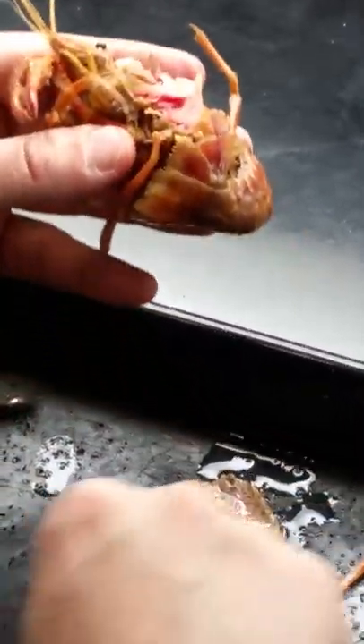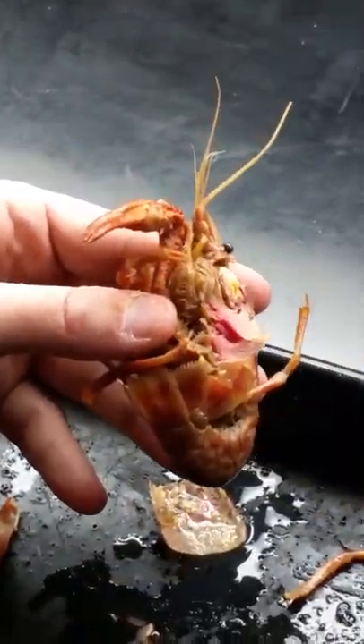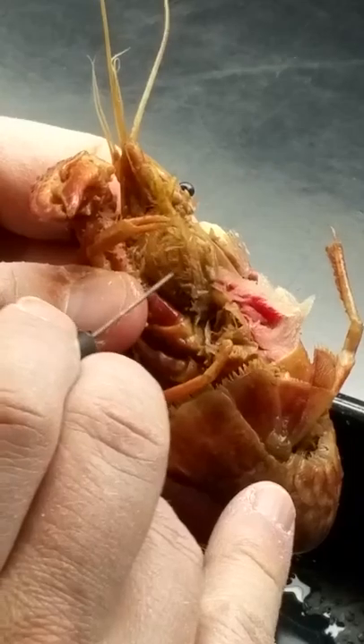That's the basic cheliped — that's the part. Now I'm going to identify — this right there is the leg-like endopod on the third maxilliped.